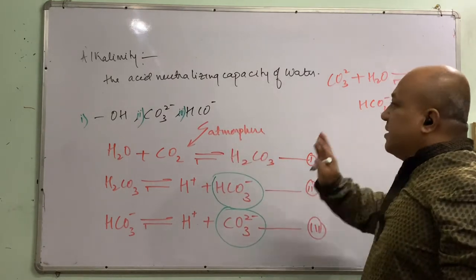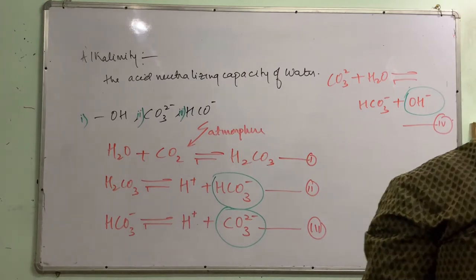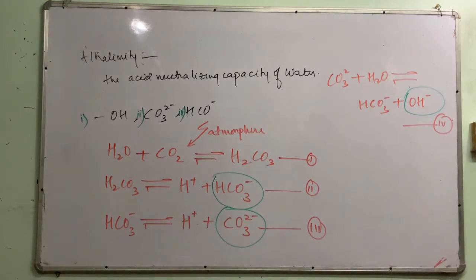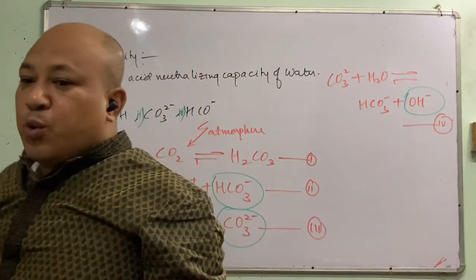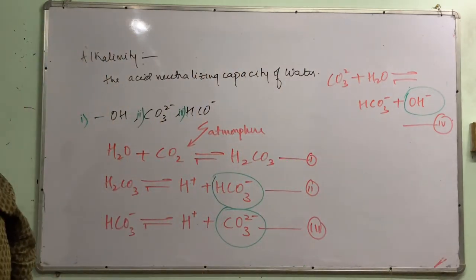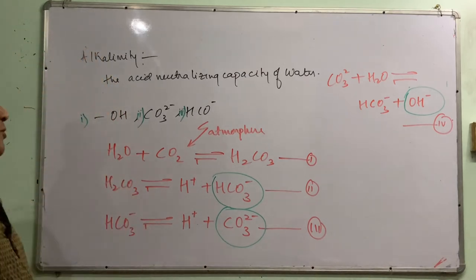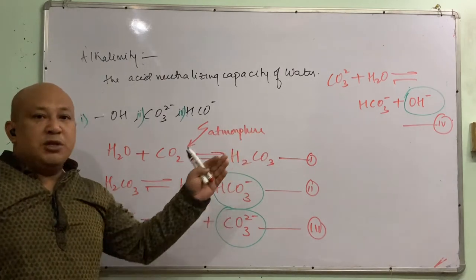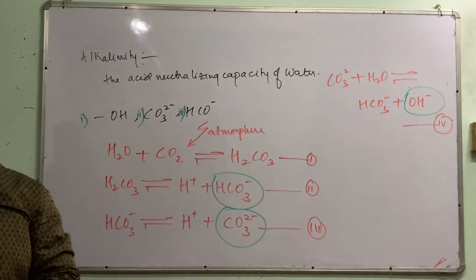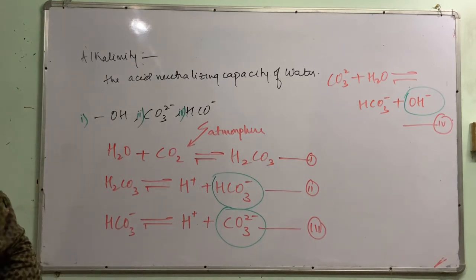And this creates the alkalinity. And why is it important to study the alkalinity? Because the more the alkalinity, the more basic it will be. Therefore, the chemical reaction or whatever we require in the neutral pH or in acidic may be affected. Okay, so this is one of the parameters to study. So this is how alkalinity comes into the picture. Now let's study directly. I'm not going to go into much basic fundamentals. I'm going to go directly to the practical because this is a practical class.